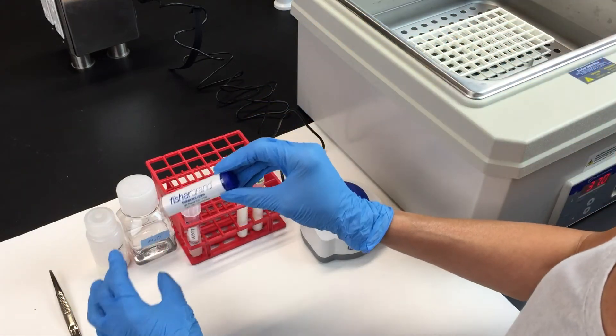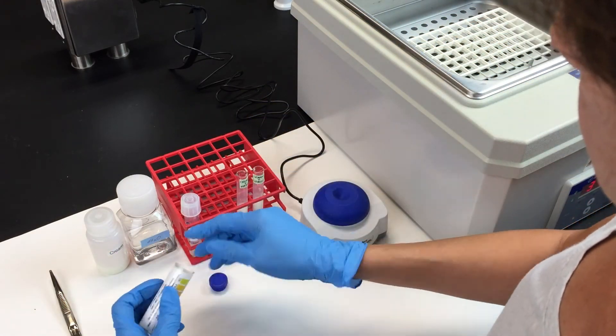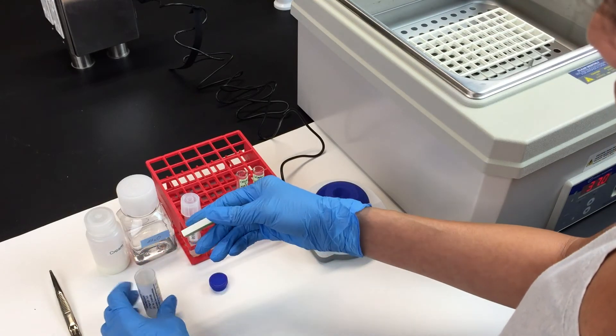Now use the pH paper provided to check the pH of both tubes and note it down.